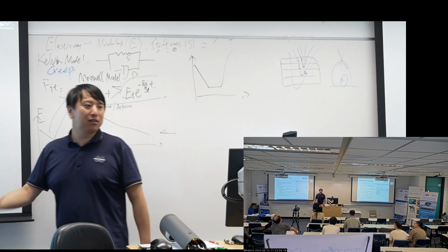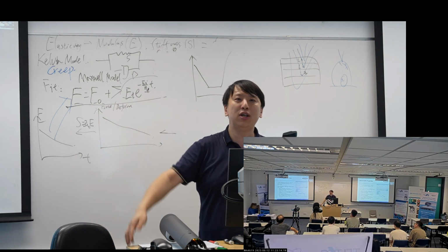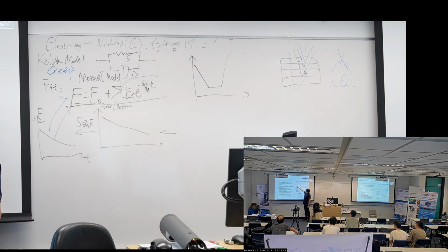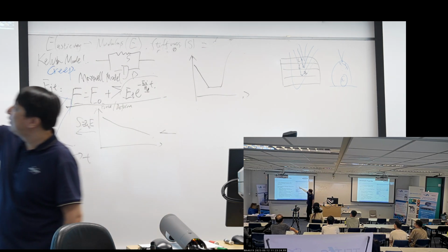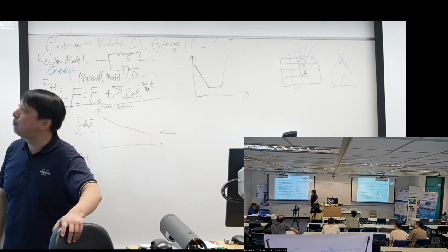This is just the first step of our force curve: moving down until I reach the maximum force. The next one is moving up until I reach a defined force. The third one is I hold the force. This is used for creep.